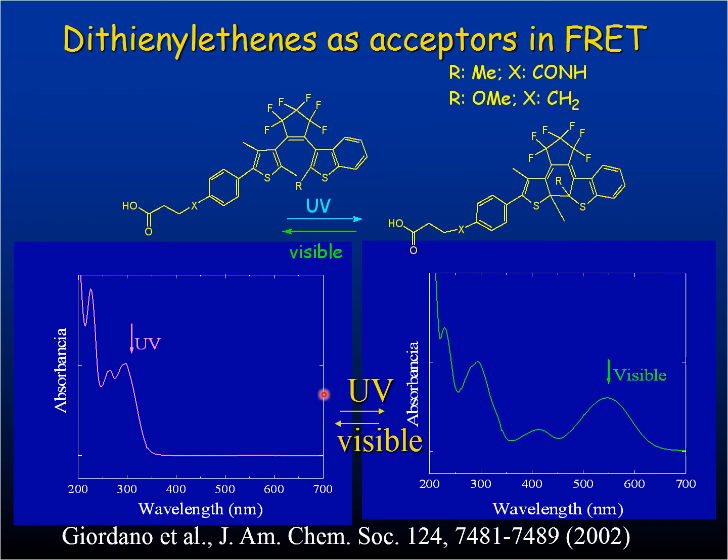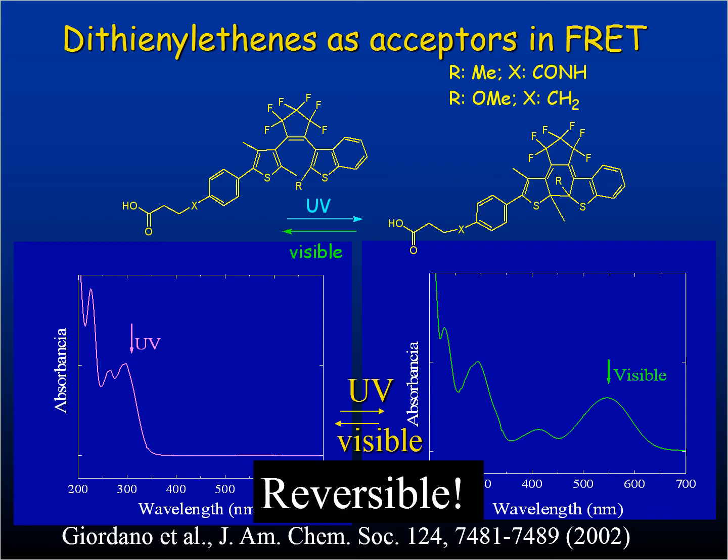But here it's important that one of them can actually absorb and act as a Förster transfer acceptor, whereas the other form does not. And so you can reversibly switch between the two states, and that allows us to perform acceptor bleaching experiments, but instead of bleaching we are reversibly switching back and forth, which avoids the potential problem in the interpretation of a slowly converting effect of one of the dyes.